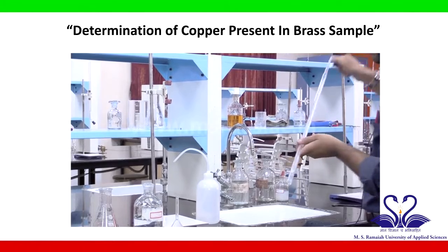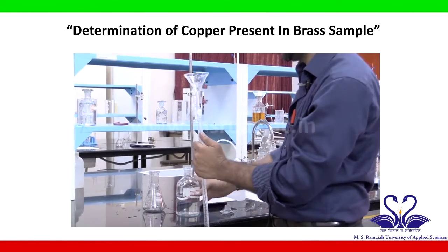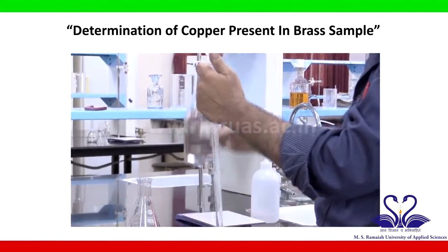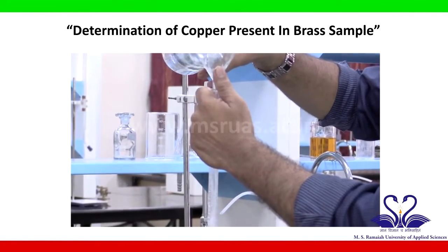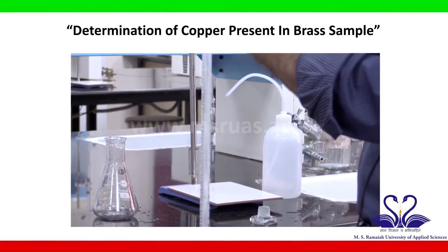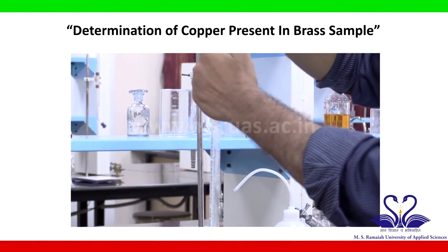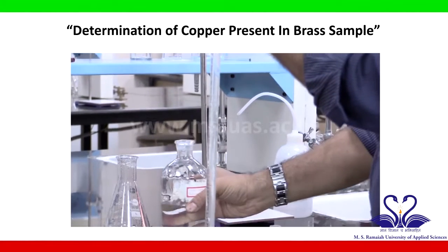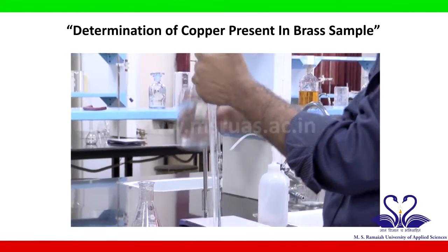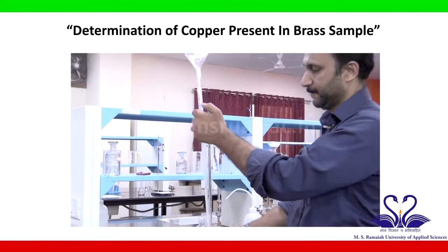Okay, now it is rinsed. I will fill the thiosulfate and keep it ready. Watch carefully, some air gap should always be there. Take it above the mark.